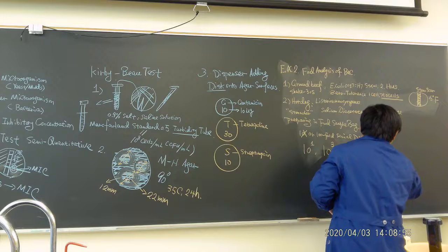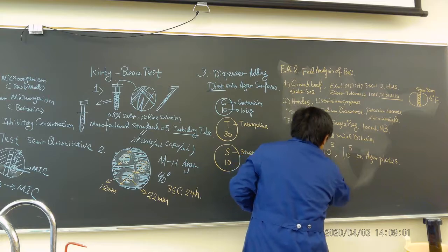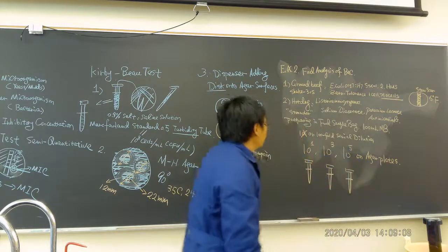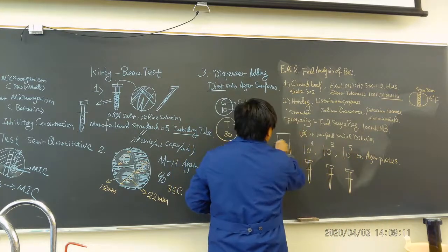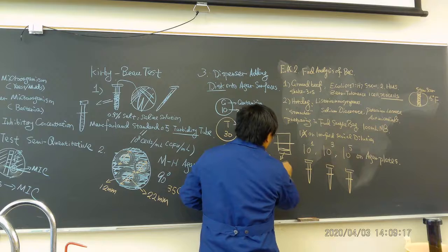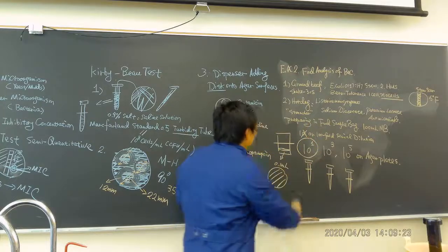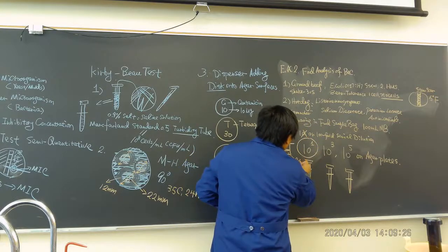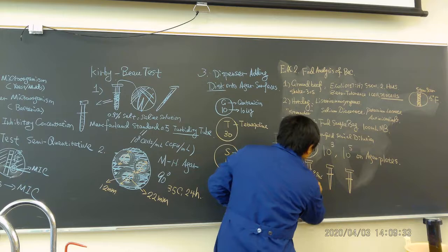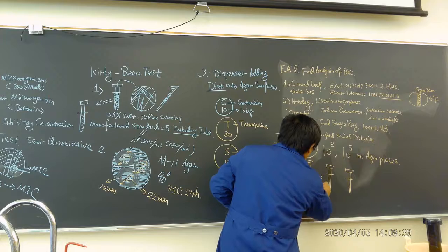And you can figure this one out, how to do it. Remember, you're going to get those tubes. This is the original sample bag. You have a hot dog there, let's say. If you add 0.1 ml onto the agar plates, that is 10 to the 1. Then if you add 0.1 ml into 9.9 ml buffered peptone water and then 0.1 ml goes to the agar plates, that is 10 to the 3rd.